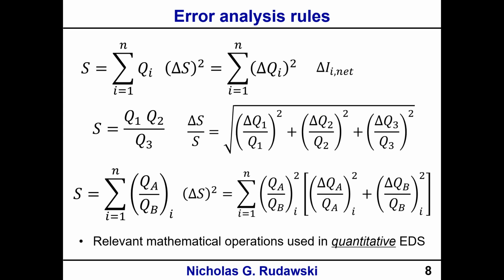Notice that I use little n here and not big N, because we're denoting that this is not the number of elements per se, just the number of components in the sum. So these are the relevant mathematical operations in quantitative EDS.